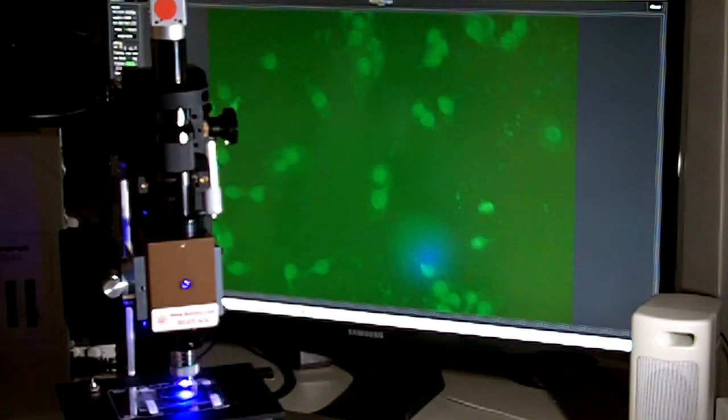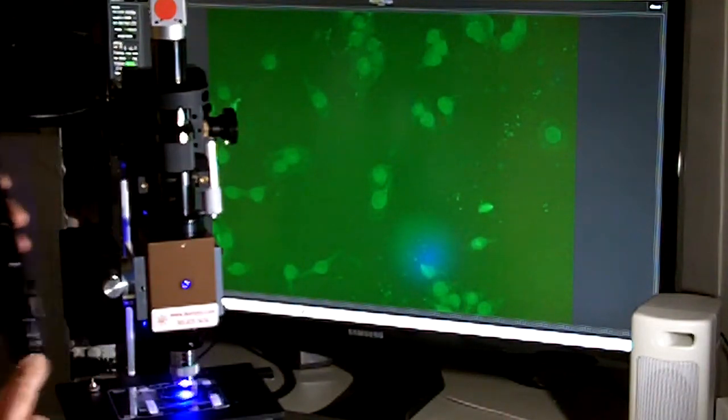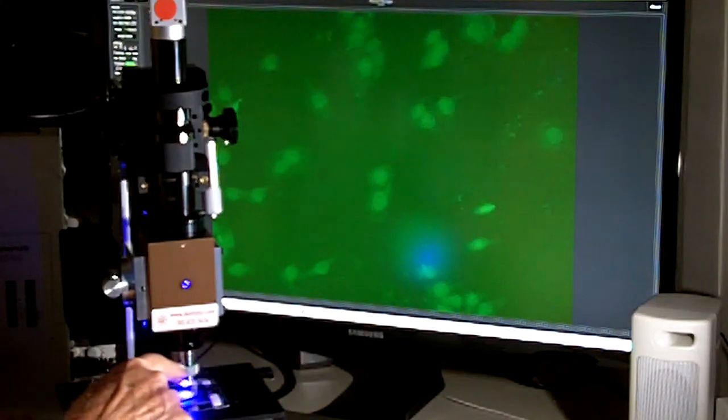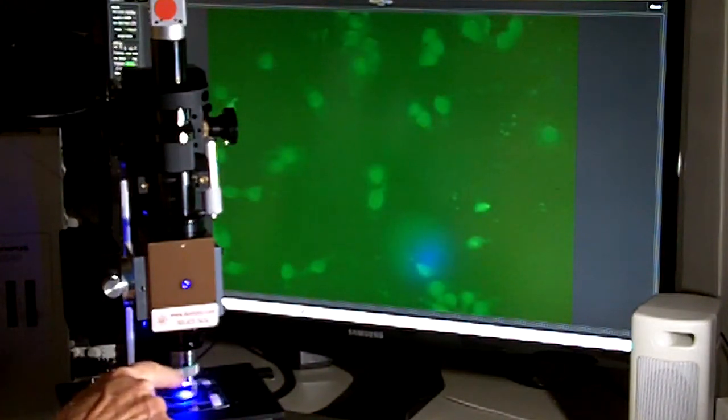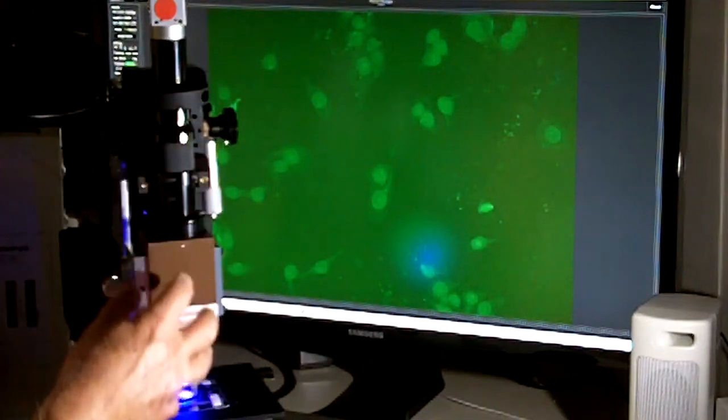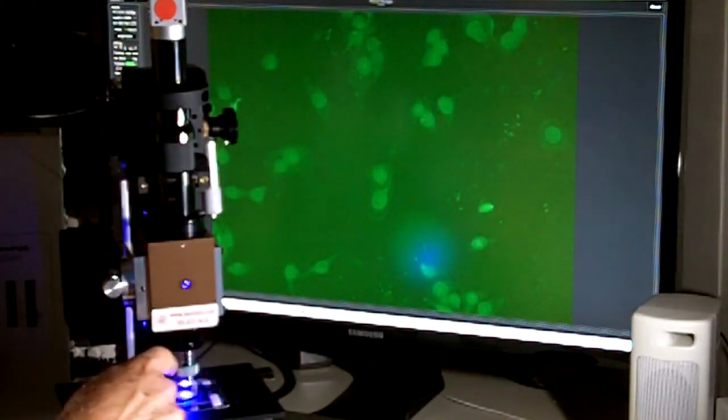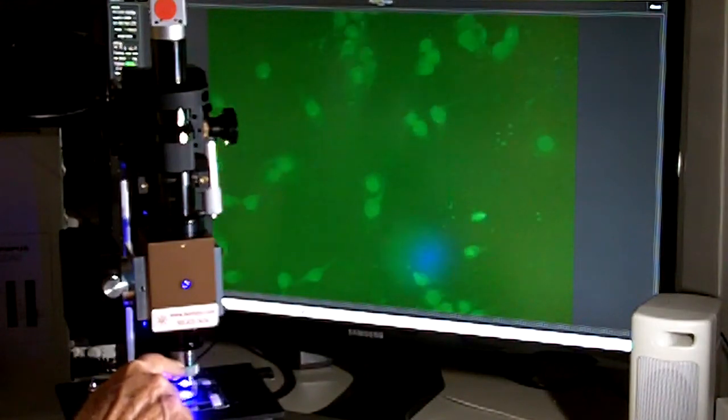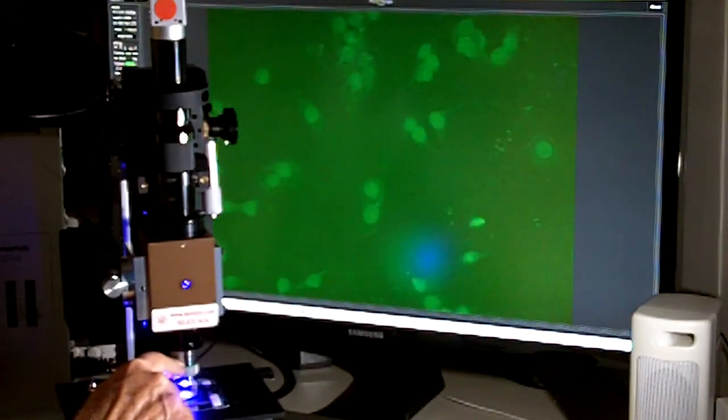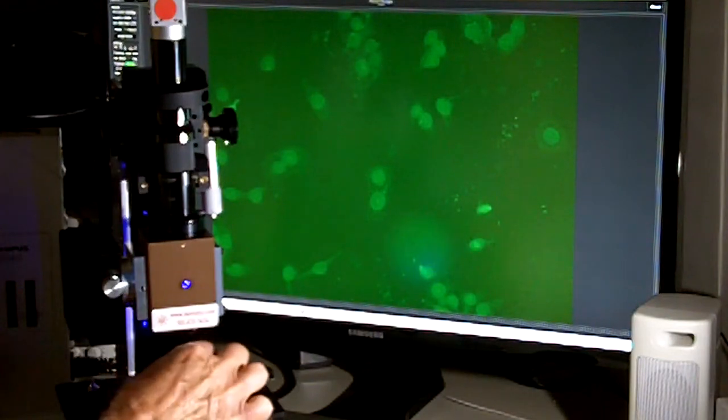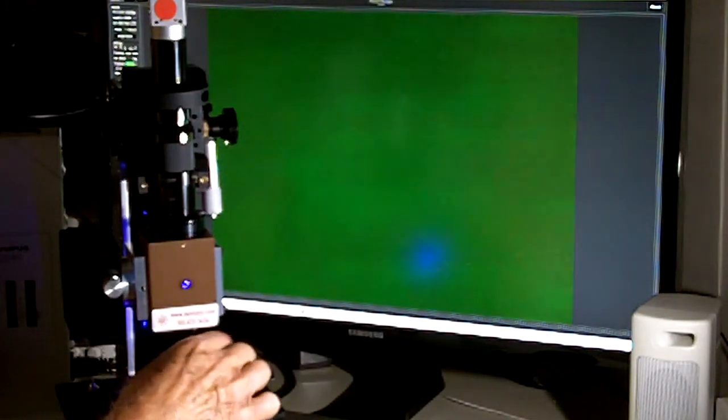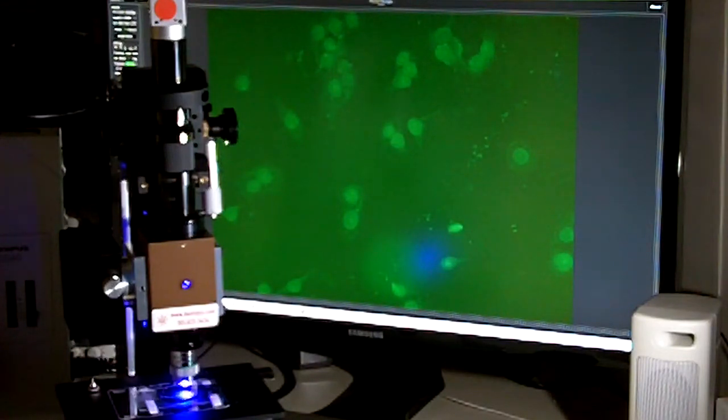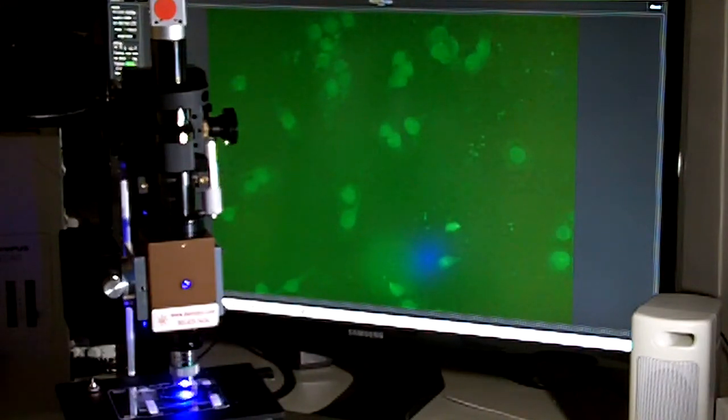Instead of using a low-power 2x objective, in this case we're using a Leitz infinity corrected 25x objective. So this is the configuration that you would use for high magnification. Or we can take this 25x objective off and put on to the front lenses just RMS thread. We can put the low-magnification IF optics from Infinity Photo Optical and do low-magnification fluorescence.